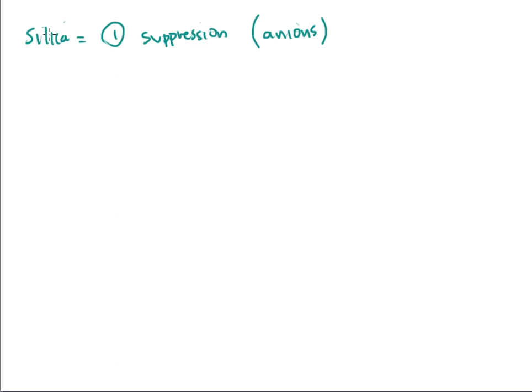Silica has an interference with the suppressor unit, and it can contaminate the suppressor and prevent it from doing its job. So the suppressor can become overloaded and start giving me a really high conductivity value. The suppressor is going to be kind of hard to get dislodged, cleaned out and rinsed, and it's all due to the silica particles on the inside of this column. It can release things, and maybe even the silica itself can go through and cause problems in the suppressor unit.